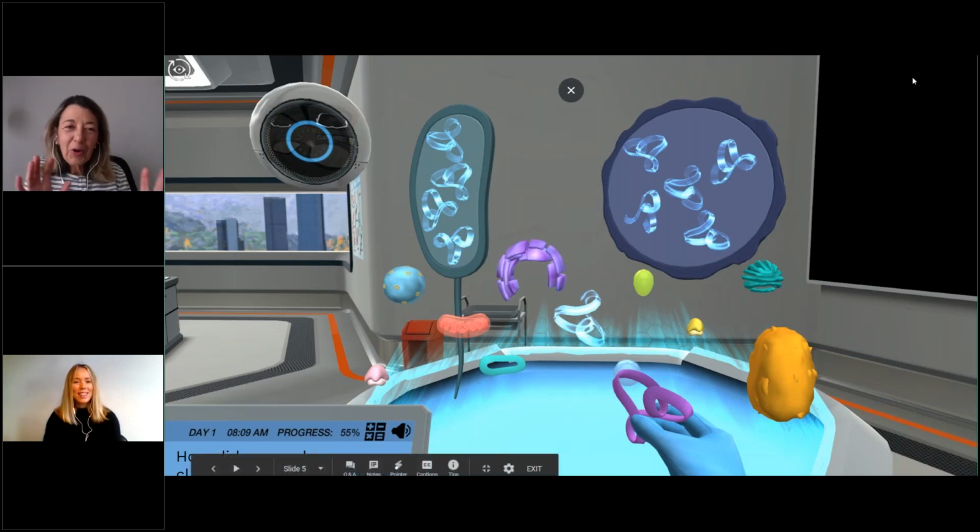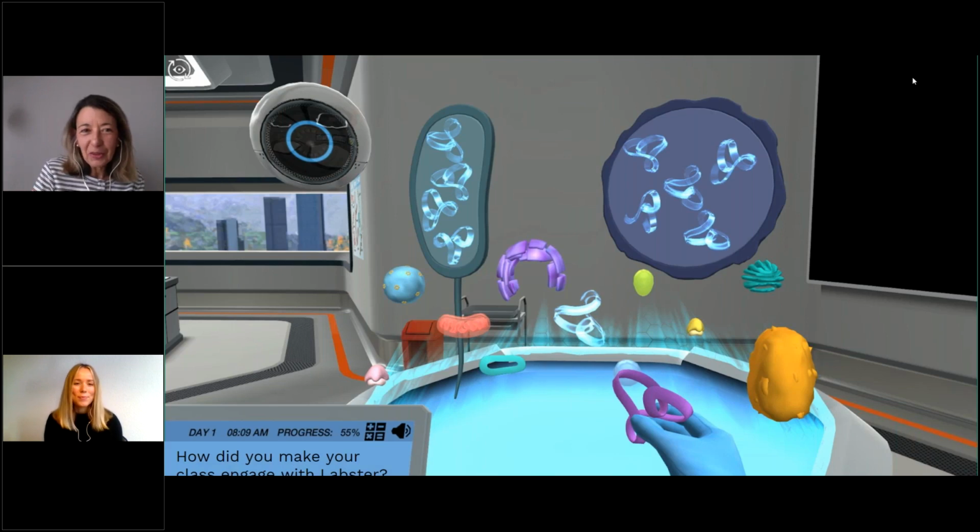Okay, so here come the practical details. Everything is about the details. So one thing is that as instructors, we should do the simulations ourselves. That's really important, not only because it makes it easier to help students if they have any issues, but also to understand how it works and again appreciate it. When I did the BSL-4 lab, I was very impressed with the level of detail of handling Ebola. I think it was Ebola or anthrax, one of those evil ones. So instructors, do your homework before giving it to the students.